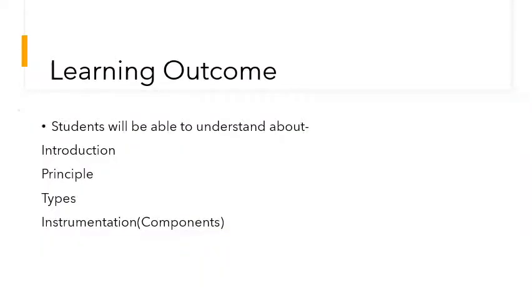What's the learning outcome of this lecture? You will be able to understand the HPLC introduction, the principle involved in the method, the various types of the HPLC, and the components involved in the instrumentation.